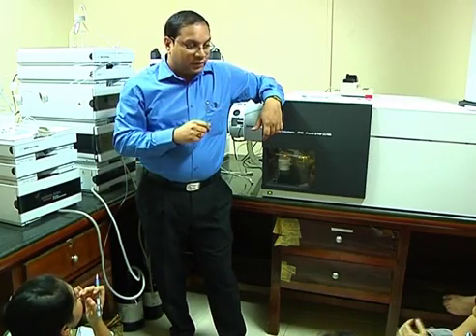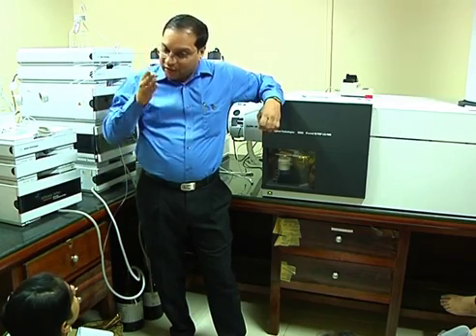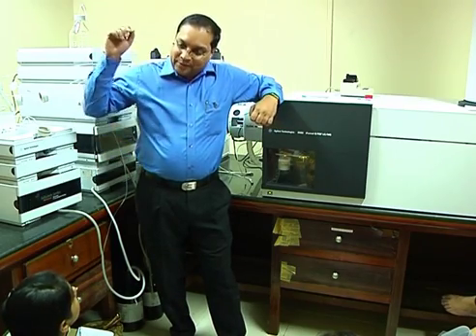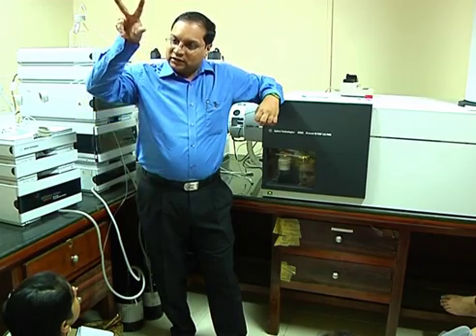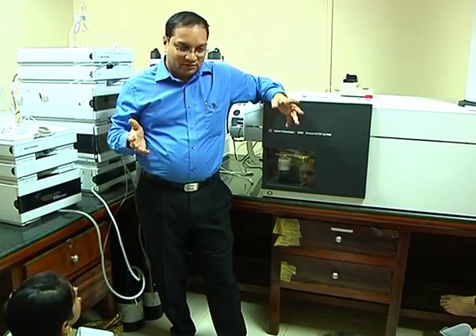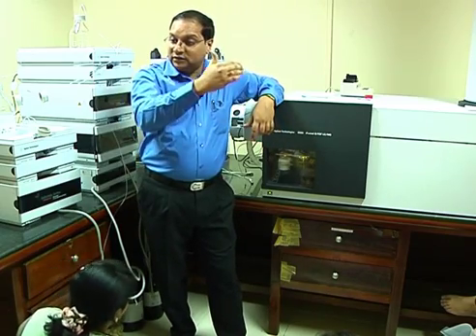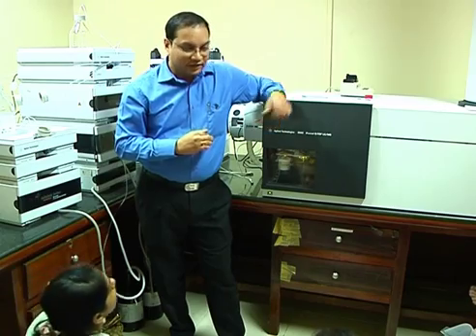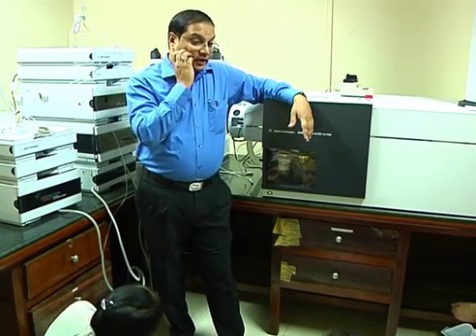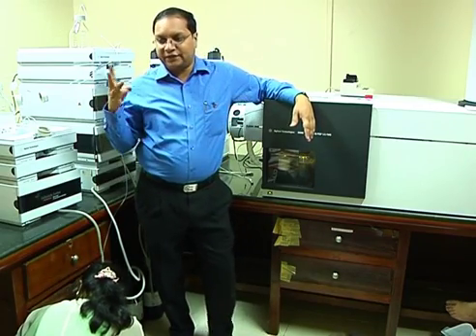But the moment you put time of flight, 500 becomes 500.12345, and the fragment of 500.12345 becomes 10 different fragments of accurate mass. So it is absolutely unlikely that a peptide of that sequence is giving some different MS pattern with different masses. So the match will be absolutely perfect. You started with nowhere, you ended with somewhere which is reliable. That's why we need time of flight. Okay. So as a functional, now as an applicability, how we apply that? So broadly, the Q-TOF can be run in 3 different modes.